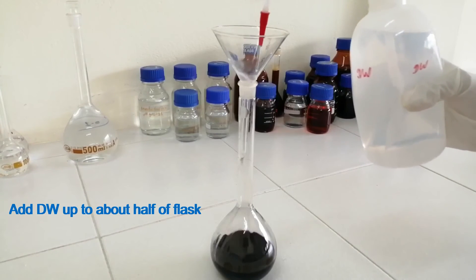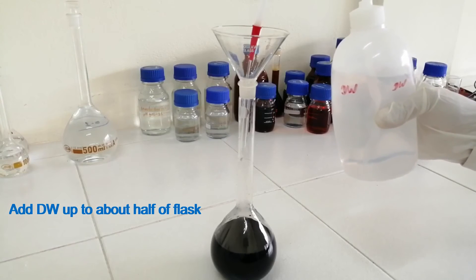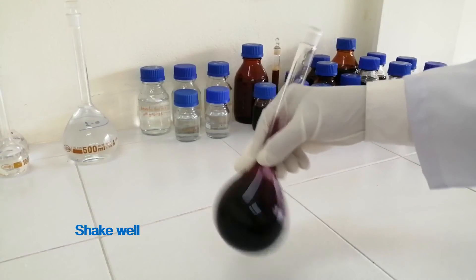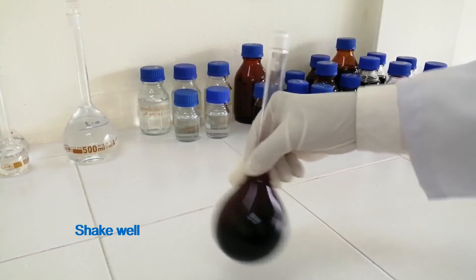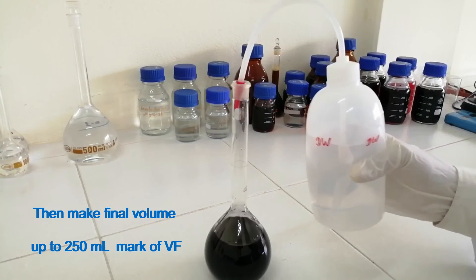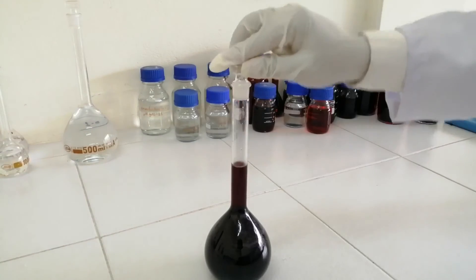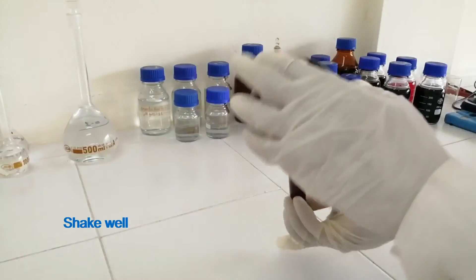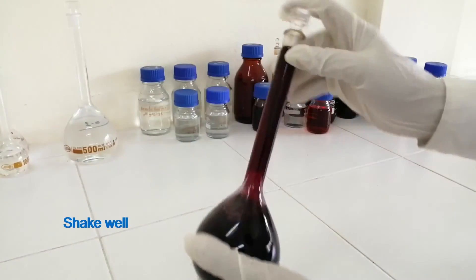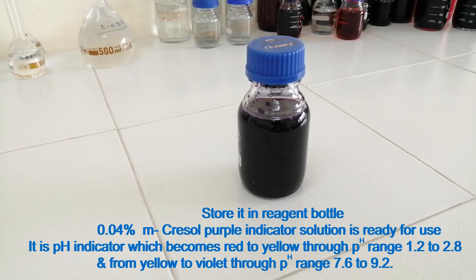Add distilled water up to about half of the flask. Shake well. Then make the final volume up to the 250 ml mark of the volumetric flask. Shake well. Store it in a reagent bottle.